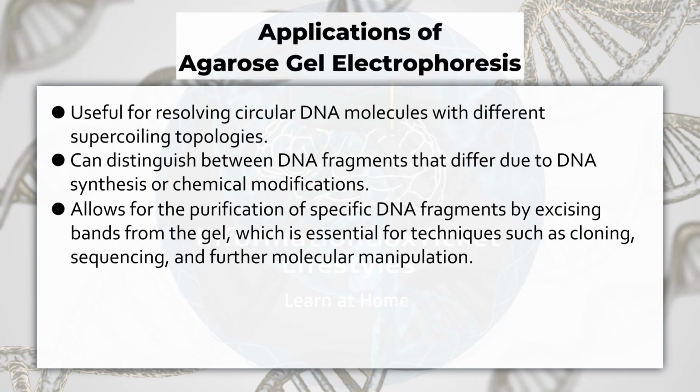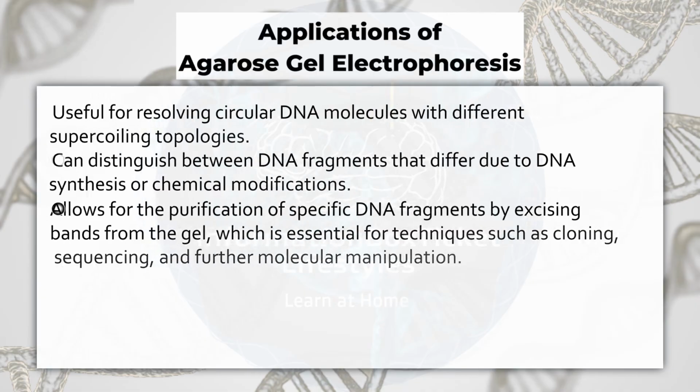Allows for the purification of specific DNA fragments by excising bands from the gel, which is essential for techniques such as cloning, sequencing, and further molecular manipulation.